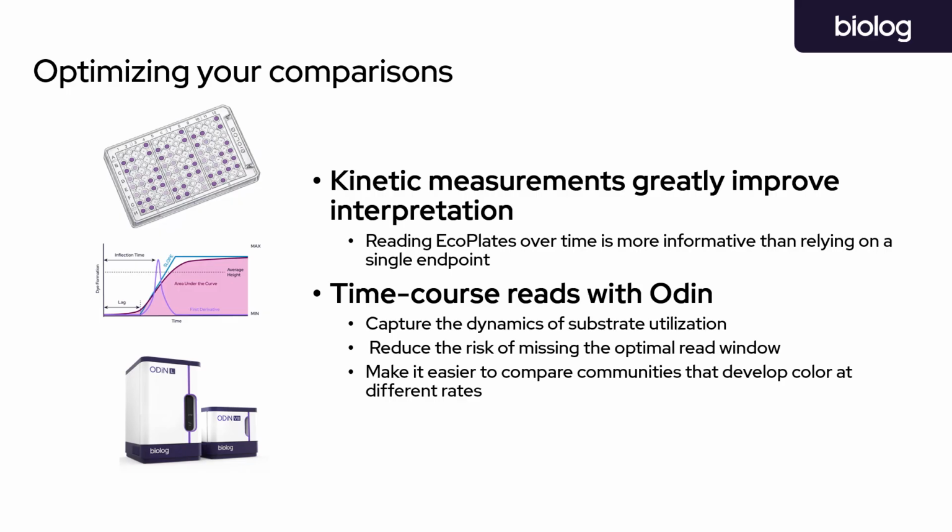These time course measurements also allow you to capture the dynamics of the substrate utilization across time. So you can do both time series with kinetics, and you can identify the optimal read window by doing kinetics. So that way you know when you read the plate, it was already at the maximum height of that curve, or if you need to change the time to read those plates, right? This is important, particularly when you're comparing microbial communities from very different environments, right?